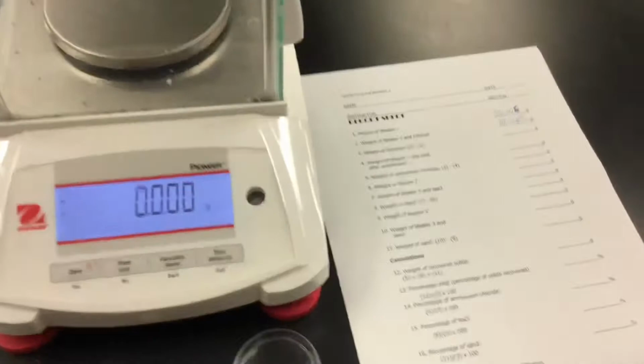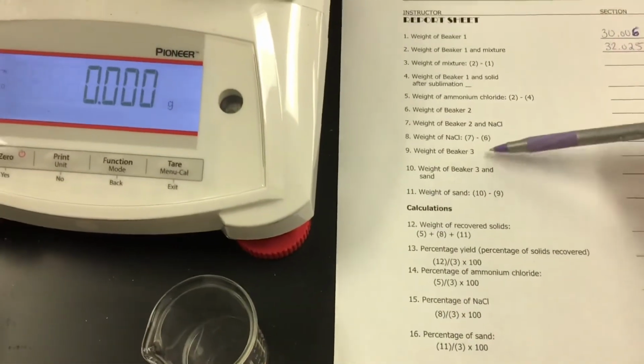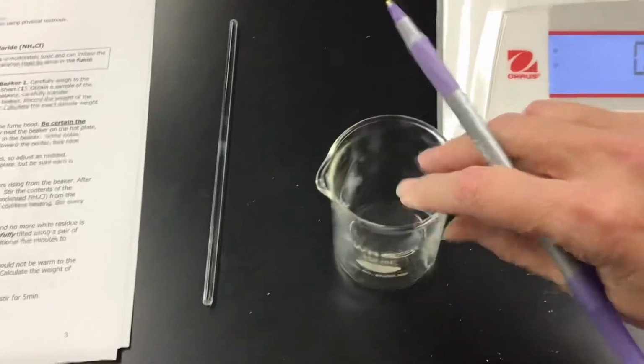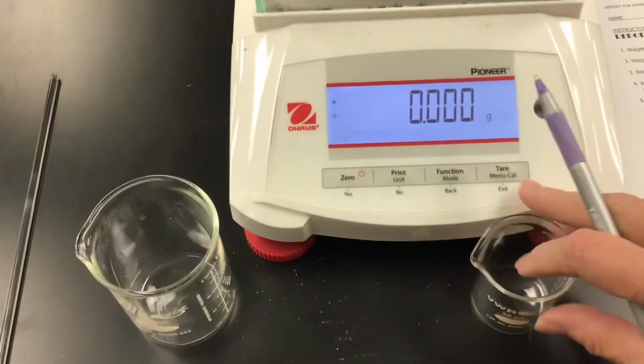While we're waiting, we're going to need a beaker 2 and a beaker 3. Just to distinguish between the two, we're going to use the 150 ml for beaker 2, and the 50 ml for beaker 3.